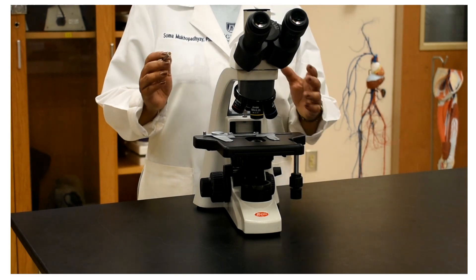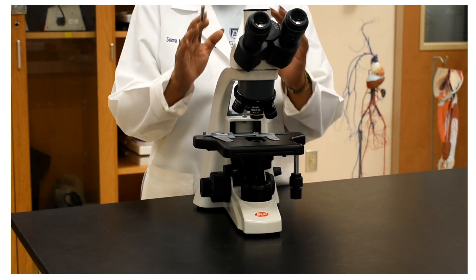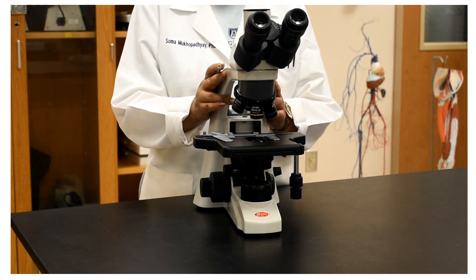Today we are going to look at a compound microscope, its different parts, their functions, and the proper handling of a microscope in a lab.